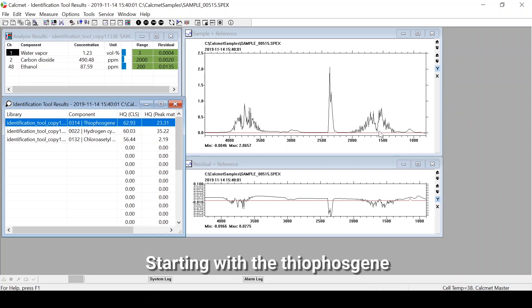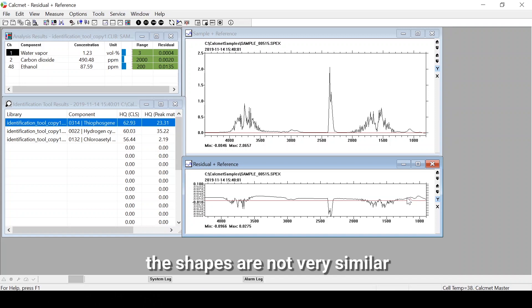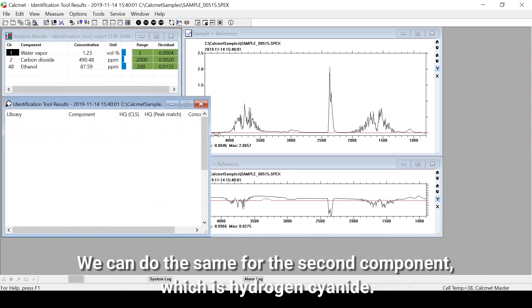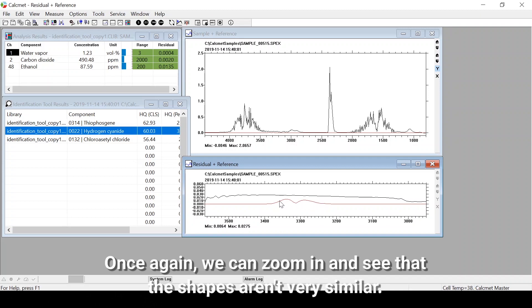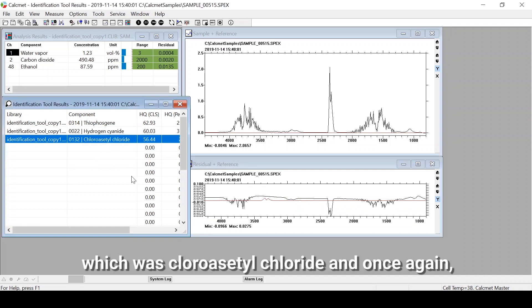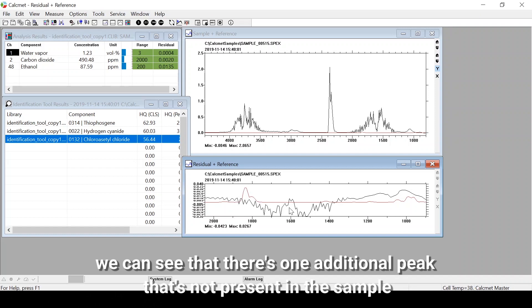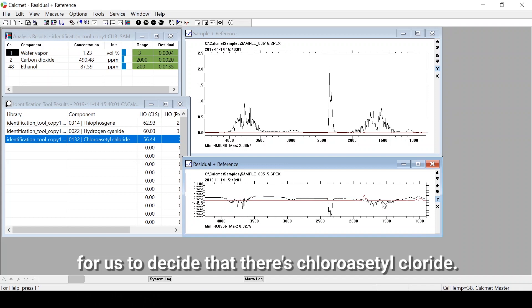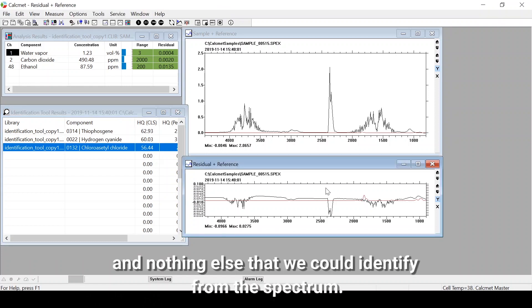Starting with thiophosgene, we can zoom in and see that this is probably not a very good match — the shapes are not very similar. The same applies to hydrogen cyanide. For the worst match, chloroacetyl chloride, there is one additional peak not present in the sample, and while some features are somewhat similar, they are not similar enough to conclude it is present. So I would conclude that we have ethanol and nothing else that we could identify from the spectrum.